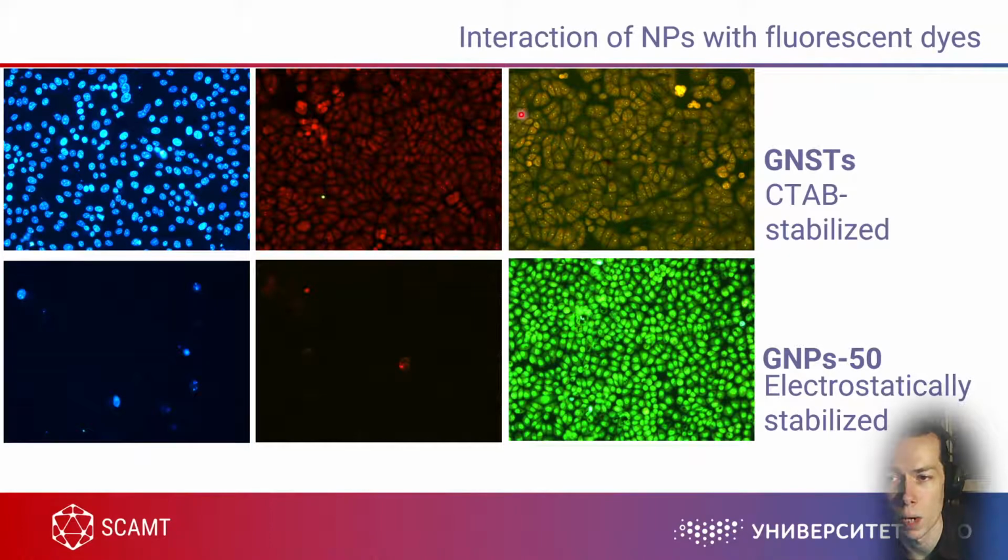But why the change in color? Because acridine orange, as I mentioned, can stain DNA in green and RNA in orange, but at the same time it's pH dependent. In acidic conditions, acridine orange has more orange color than green color.